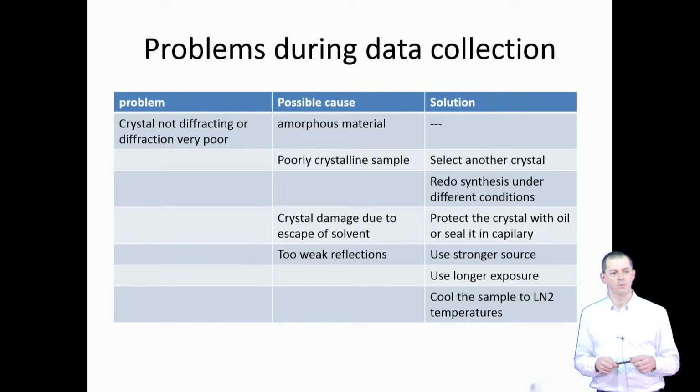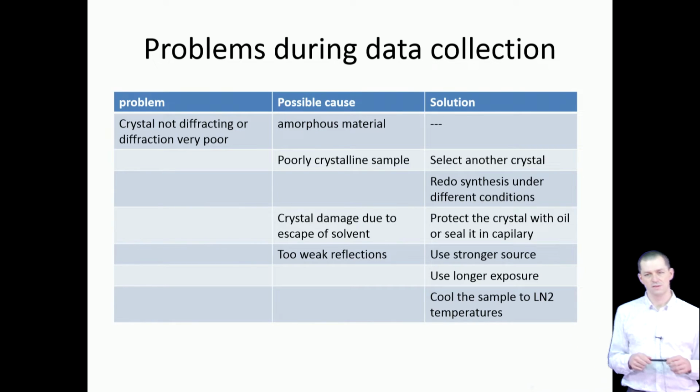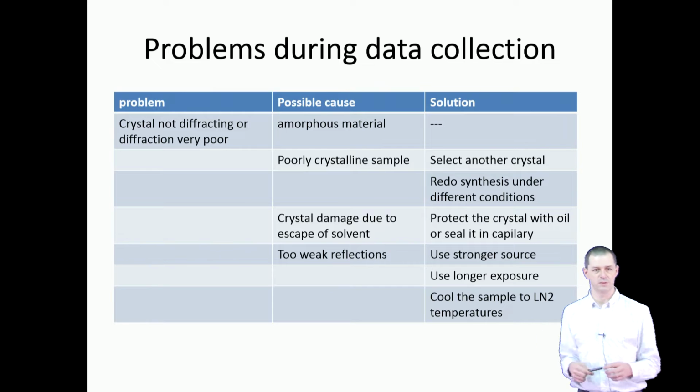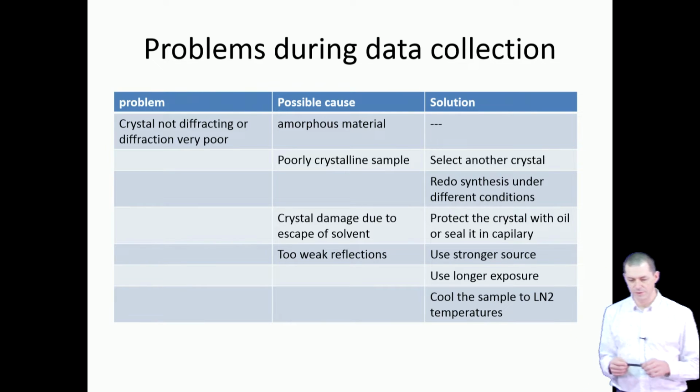The crystallinity obviously depends very much on the synthesis route, so you can reconsider the synthesis, the crystallization under other conditions, maybe slower crystallization to get better crystals.